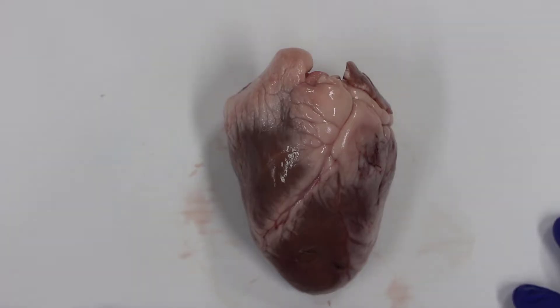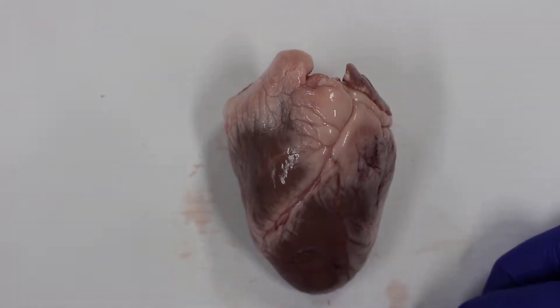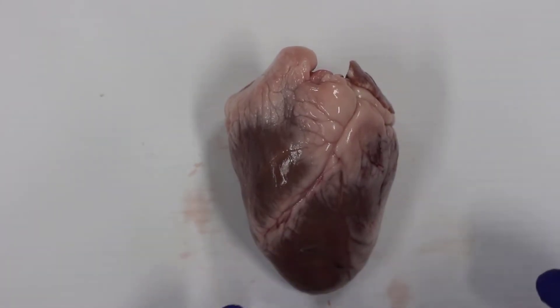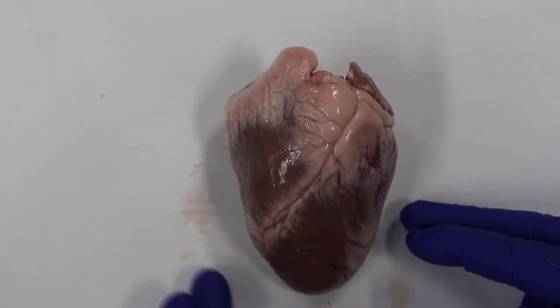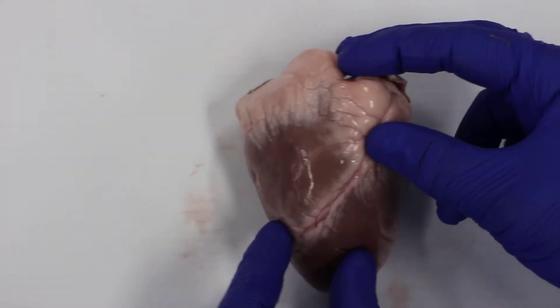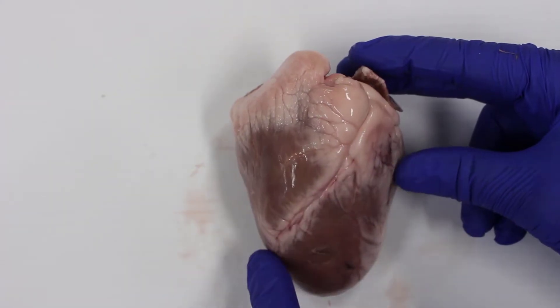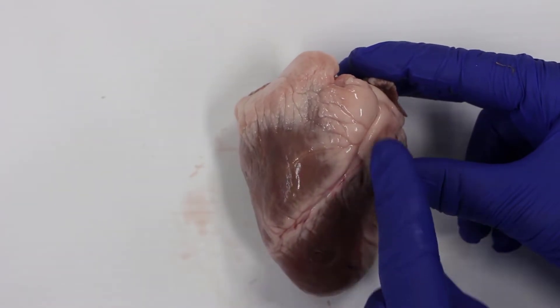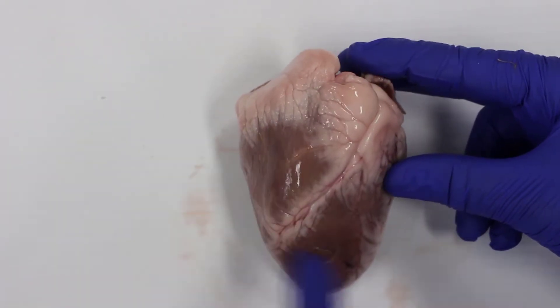This is actually the front of the heart. When we describe a heart, it's as if it's looking at us, so we say that the left hand side of the heart is over here, and this is the right hand side. We know it's the front because we've got this running through here — this is called the coronary artery, or coronary sulcus. Coronary is related to the heart.